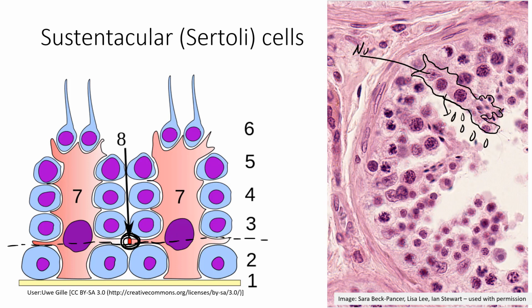the external environment here. So this Sertoli cell is connected to, the nucleus is down there, but we'll just say there's another one right over here. And these guys are going to be connected to one another by these tight junctions. And that's going to form what's known as the blood-testis barrier.